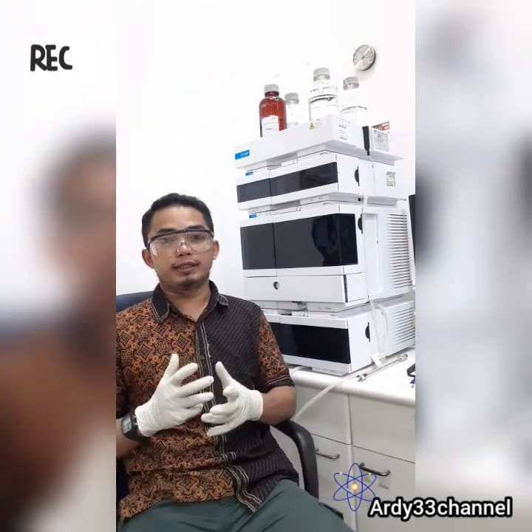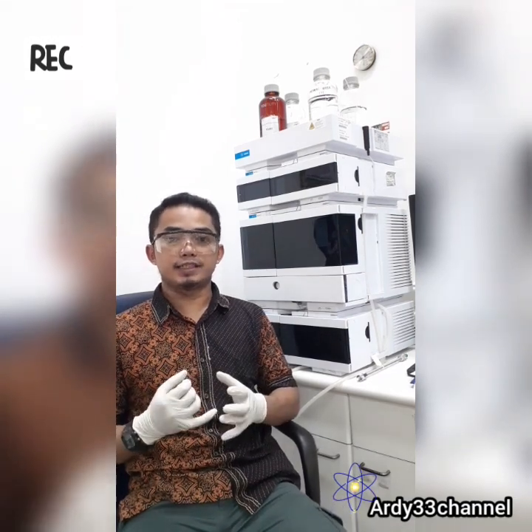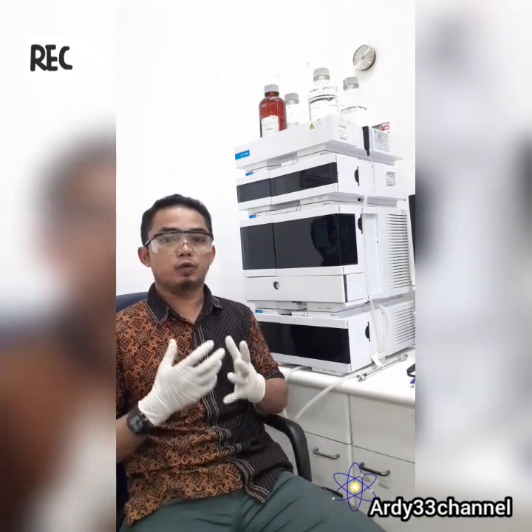I want to tell about advantage and limitation for HPLC. Number 1, good speed for analysis. Number 2, the advantage is efficiency. Number 3 is accuracy, good accuracy for analysis. And number 4, versatile and extremely precise when it comes to identifying and quantifying chemical components.